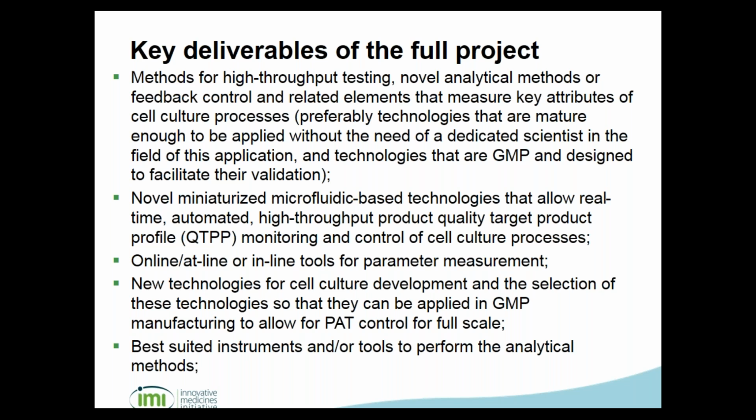Miniaturized microfluid-based technologies is something we were thinking of. Looking at high throughput product quality target product profiles, how to monitor that, how to control cell culture processes. Online, at-line, or even in-line tools for parameter measurements.